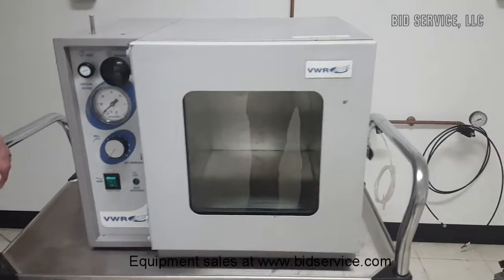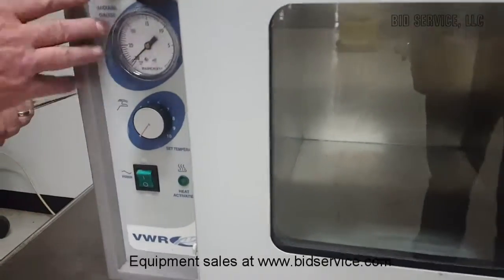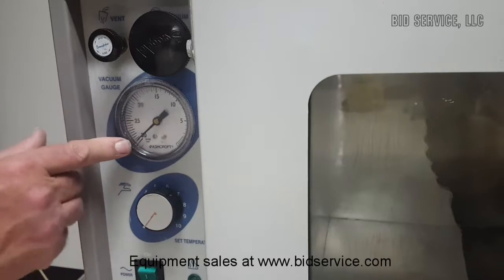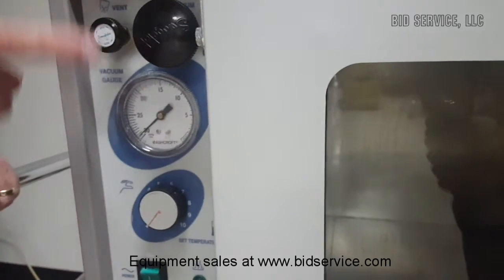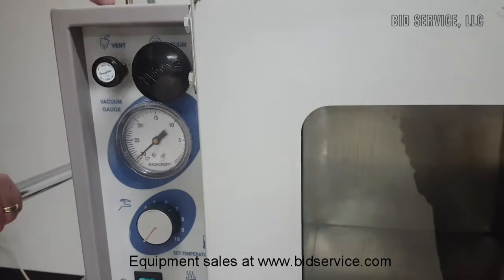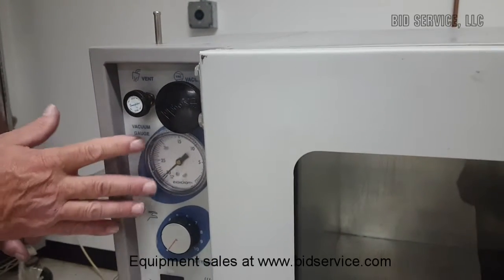This is a scientific vacuum oven. Right now it's under vacuum — it's been under vacuum since yesterday with no vacuum line attached to the back. Here's your vacuum gauge, and you can see we're at about 29 inches of mercury. Your main vacuum valve to turn vacuum on when connected is here, and your vent valve is here, which connects to this pipe — so you could introduce something through there if you wanted.